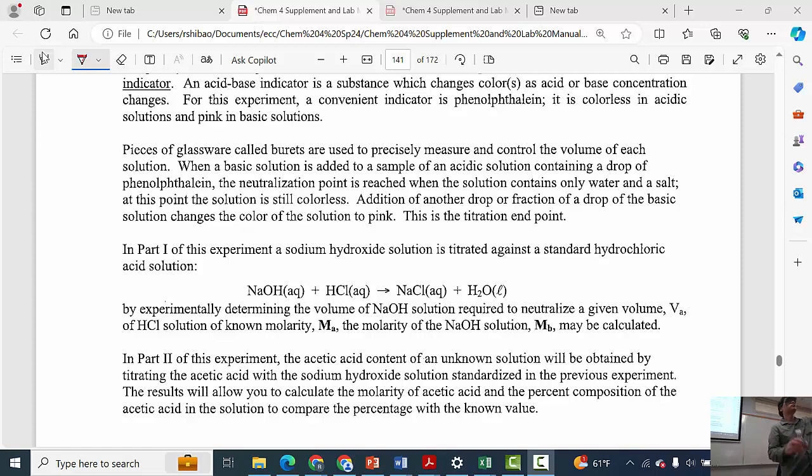And so here's my sodium hydroxide unknown solution. And I'm going to use a little funnel for this because pouring out of a Florence isn't so easy. And with the funnel, I'm going to make a little air gap here so it drains quickly. Otherwise, the funnel volume is extremely small. This is a tiny funnel, and so it's easy to overfill this. And so I'll pour in maybe about 10 mils or something, or less.